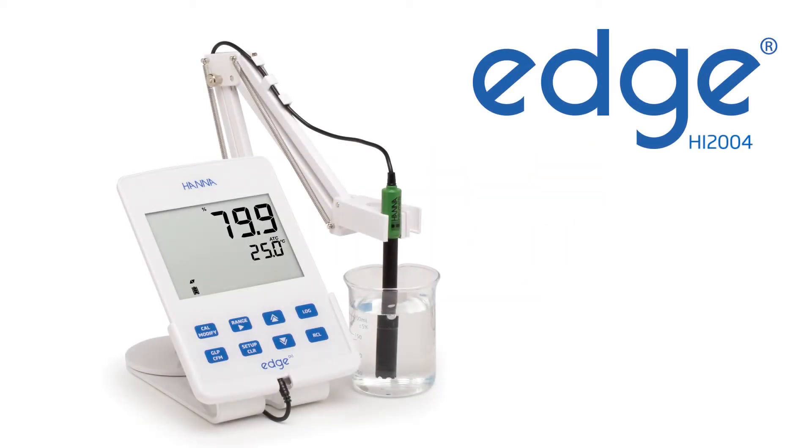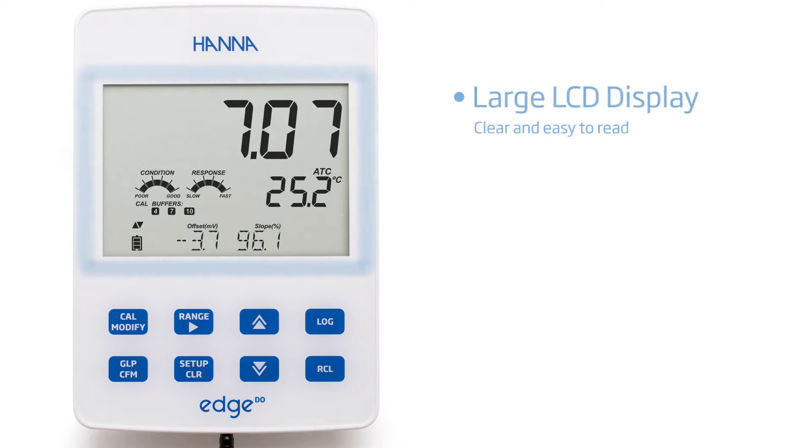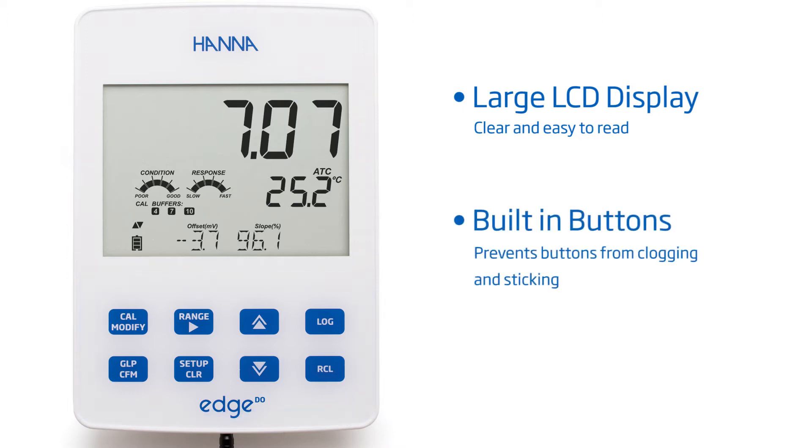The HANA HI2004 can measure dissolved oxygen in a wide variety of samples. This dedicated dissolved oxygen meter has a large LCD display for easy reading and has a capacitive touch feature with built-in buttons, preventing clogs and sticking of traditional buttons.